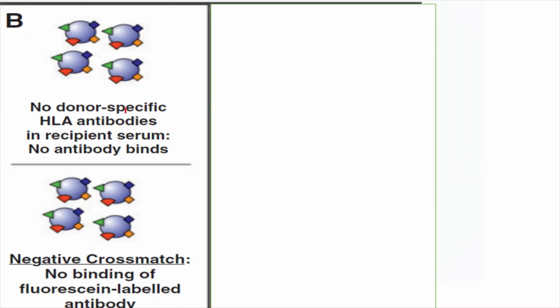See, we have put the serum and the donor lymphocytes together. There is no donor specific antibody. So the result will come as negative cross match because there is no binding of the fluorescent labeled antibody.